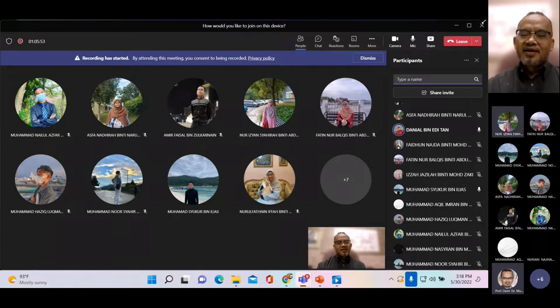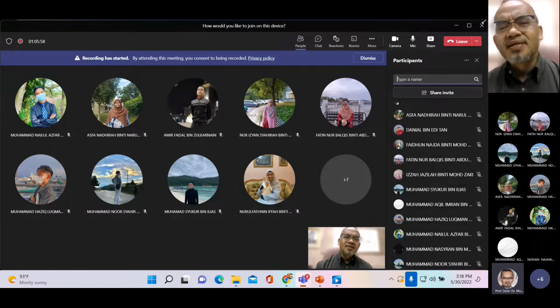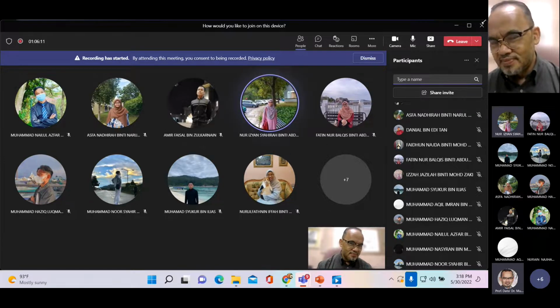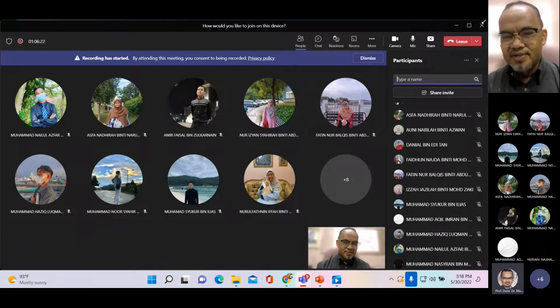Okay, jadi dia ada dua. Kenapa dia ada dua? Sebab satu nak detect function UV, satu nak detect visible. Sebab function dua lamp tu lain-lain. Okay, so apa function dia untuk dua-dua tu? Kalau deuterium lamp untuk measure UV range. Kalau tungsten tu untuk visible light range.